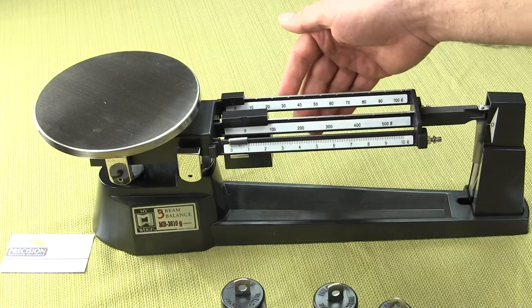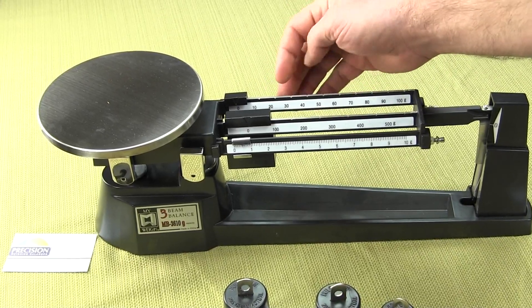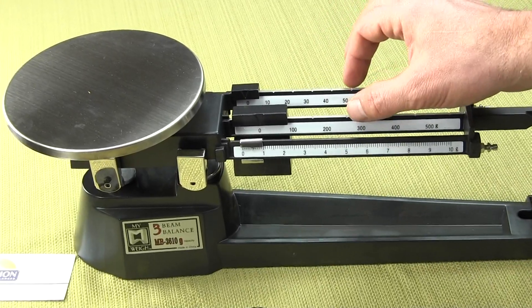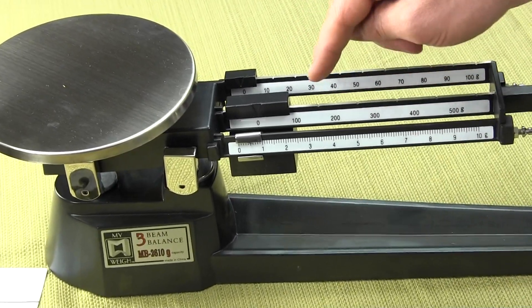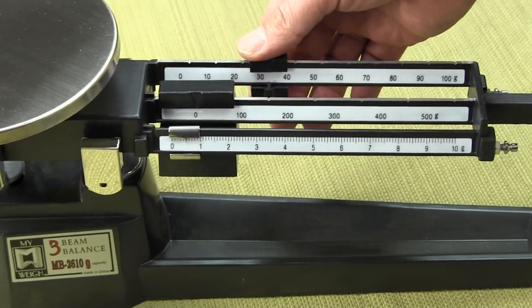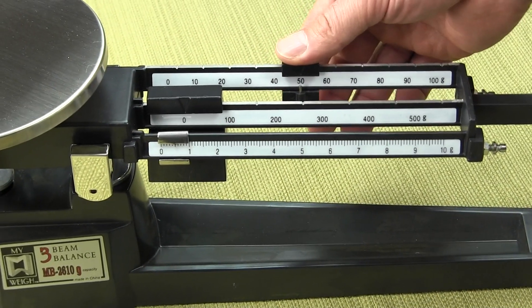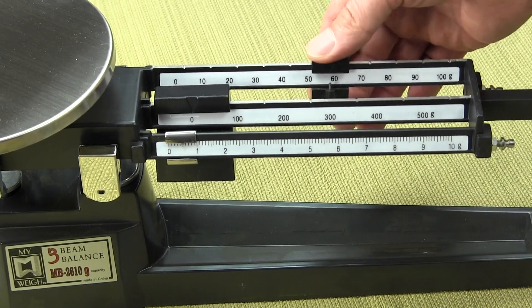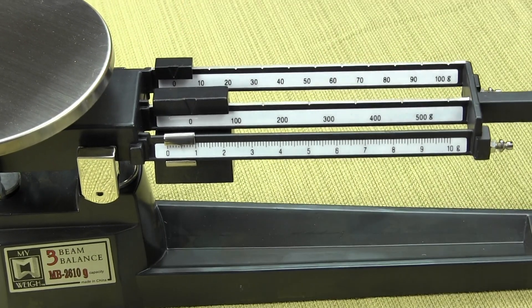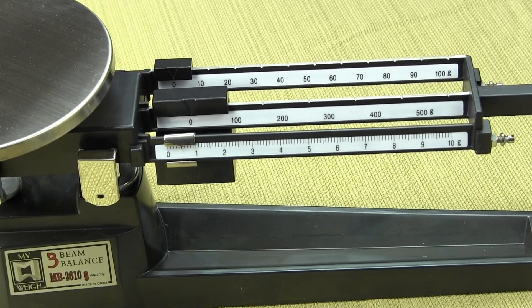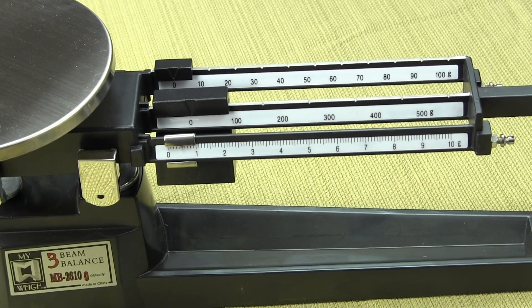Regarding the beam itself, you'll notice on the top there's some grooves here. The two rear beams have grooves. The front does not. There's a groove here, here and here. When I slide the rider it needs to rest in the groove itself. That's a nice design so there's no question what the weight reading is.